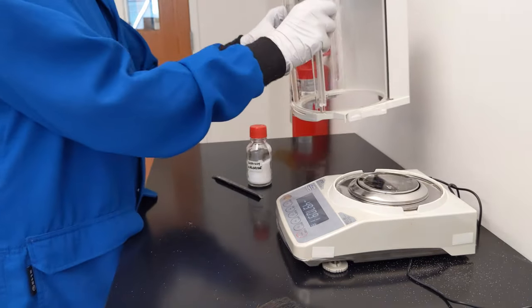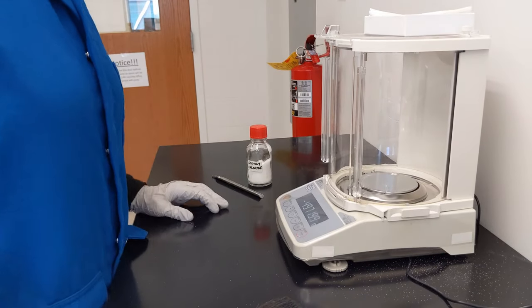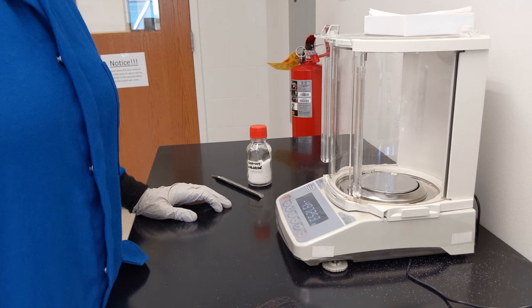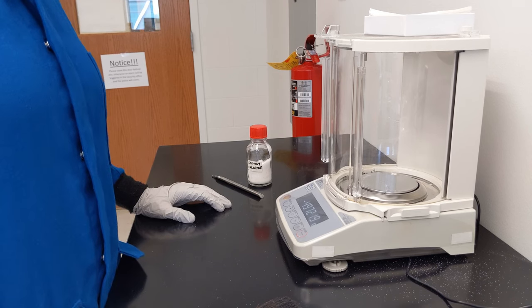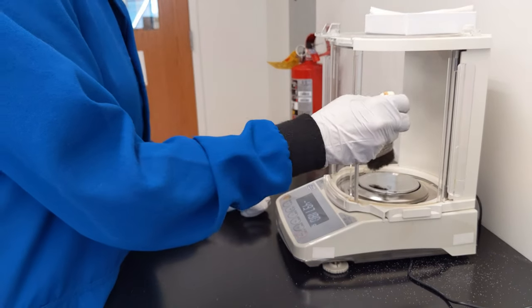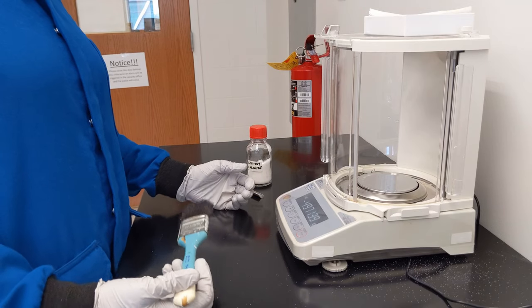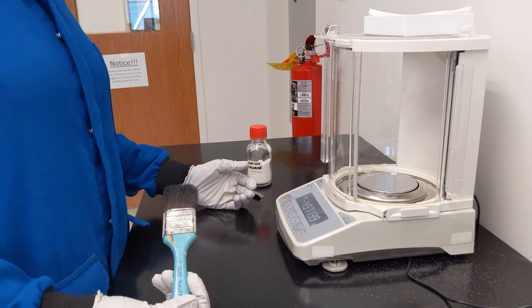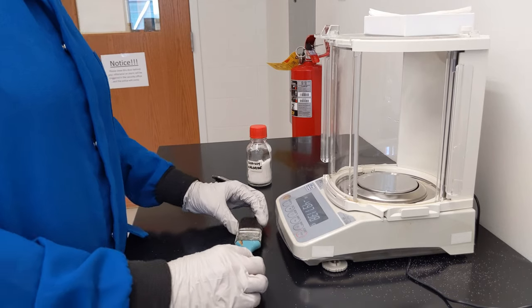Imagine that the balance wasn't appropriately cleaned and you went to measure the mass of a sample, and in the process of measuring it, it actually did get cleaned a little bit. That is going to change your recorded mass, because it would have changed the zero point. You will have measured something inaccurately because of the fact that you had a dirty balance.